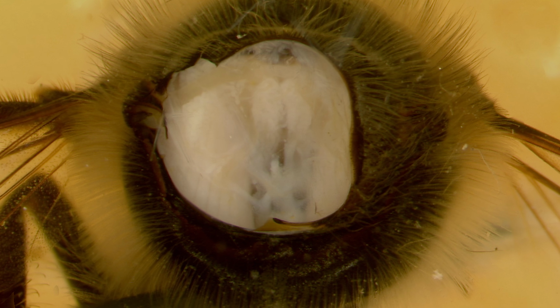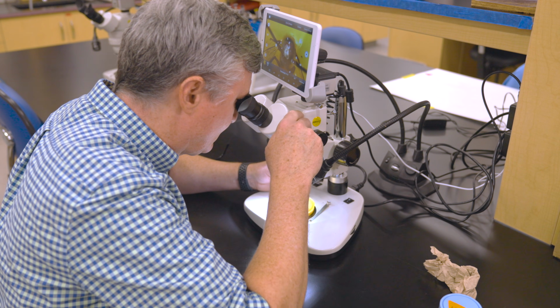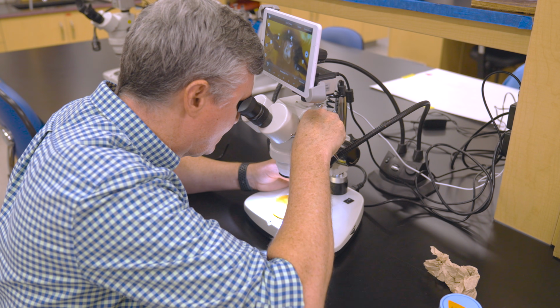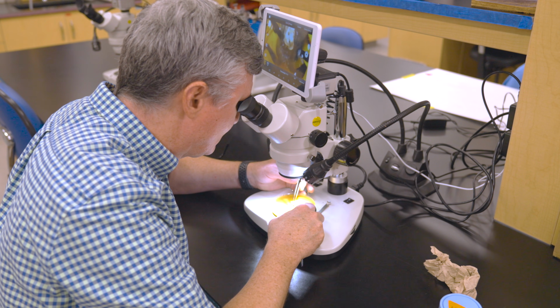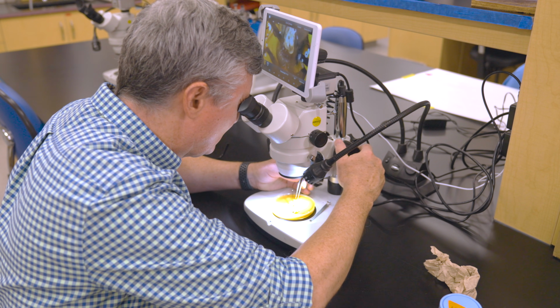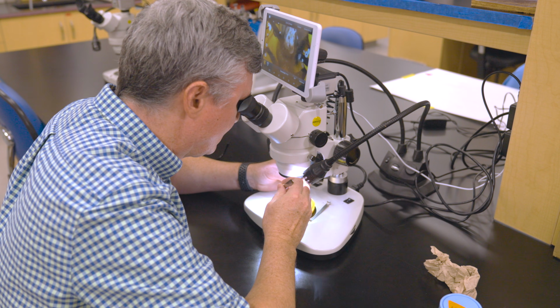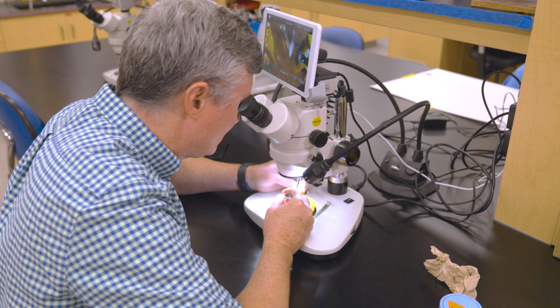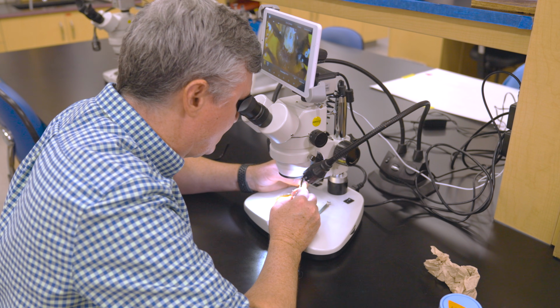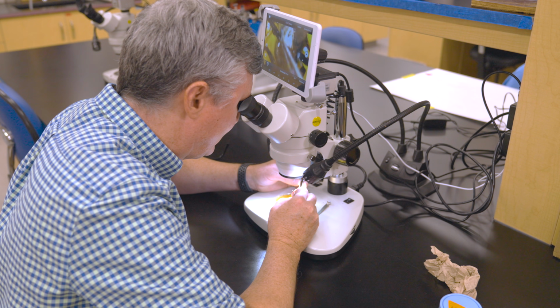So the first thing I do with forceps is grab the front pair of legs and lightly but forcibly remove them from the thorax of the bee. If you do this well, the front pair of legs comes off, a little bit of the exoskeleton in the middle part of that thorax comes off, and you're able to see muscle tissue in that opening of the thorax. And here's the trickiest part of all.